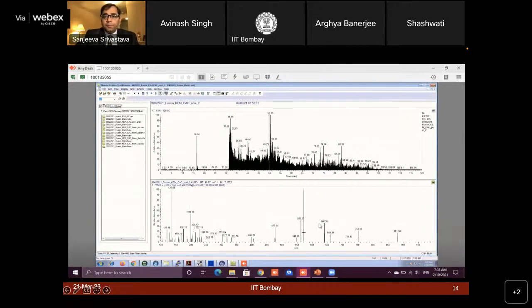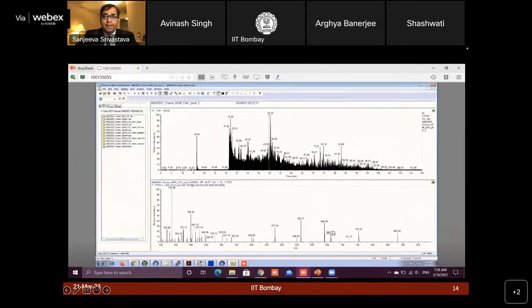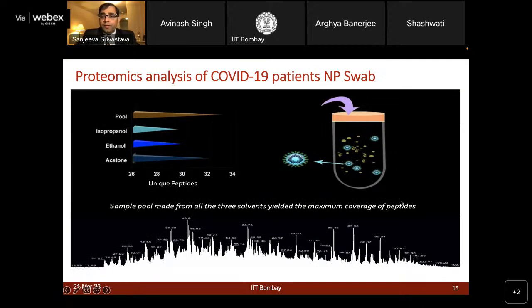All right. So what you see here at the end is the chromatogram of peptides. This is what you get from any given sample, right? In our case study today, we are talking about COVID-19. We took the nasopharyngeal swab sample from humans, from the respiratory specimens of individuals who were COVID suspected positive. Now, these kinds of chromatograms were generated, right? And from these chromatograms, one needs to find out what these proteins are. At that stage, you need to do a database search.